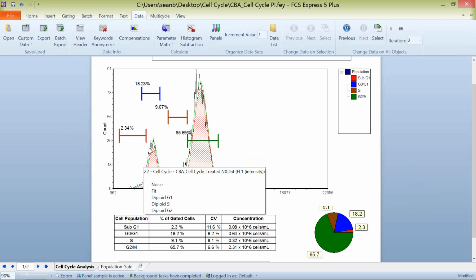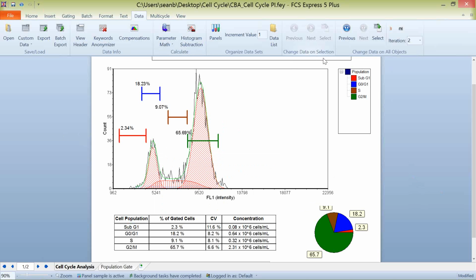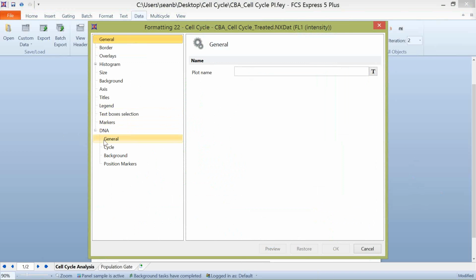For a lot of these things where there is a clear G1 and a clear G2, there won't be any problems. And it's actually not that difficult to work with this data in that case. If you have something that banks up in G1 or banks up in G2 and we don't know where one or the other is, essentially we come in and we format these DNA plots.